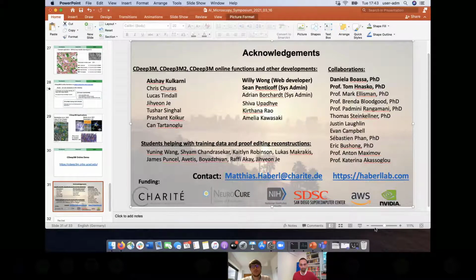Everything is organized into projects automatically. When it comes off the microscope, it's synchronized and organized, so we don't have to do that by hand. This has been going for probably 10 or 15 years. And if I want to make it public, I basically just push it from our local repository into the public repository.